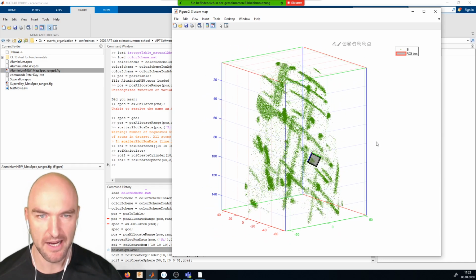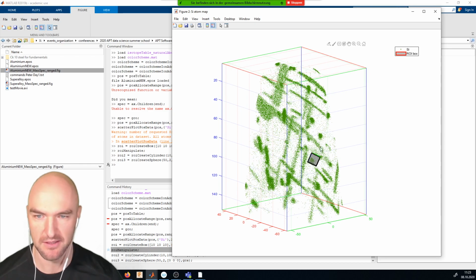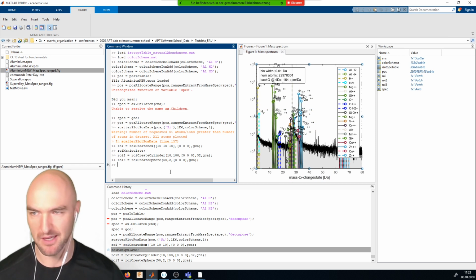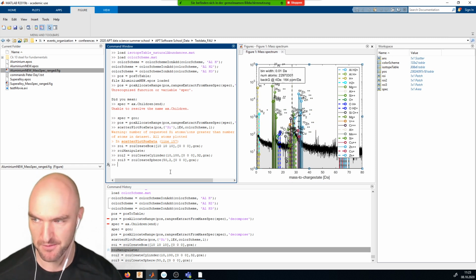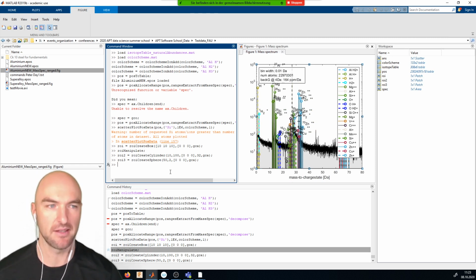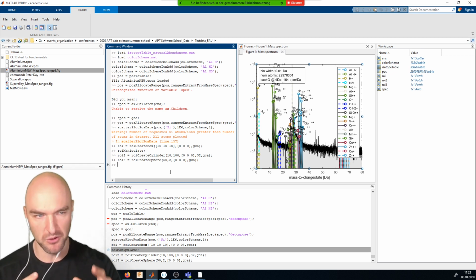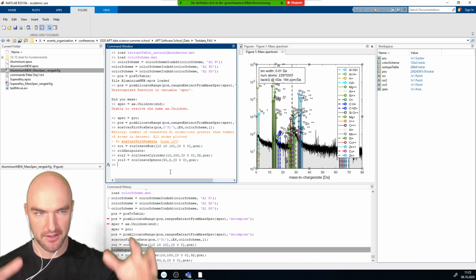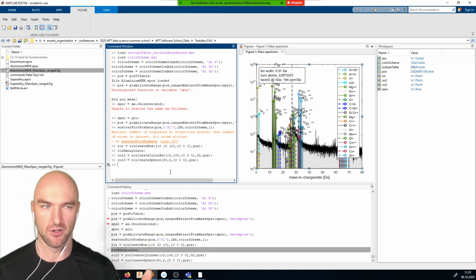And what interests us now in this case is how to visualize what's inside here, or generally how to get an idea of what's inside here. And for that, we need something that's called a containment test. A containment test is simply a program that tells you, based on some kind of object, whether something's inside the object or outside the object.